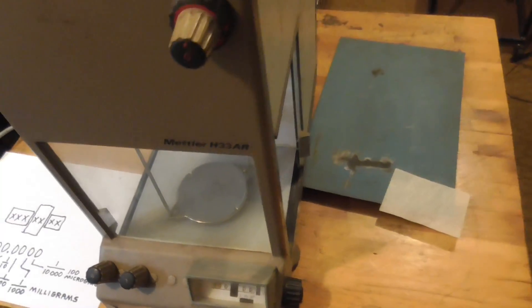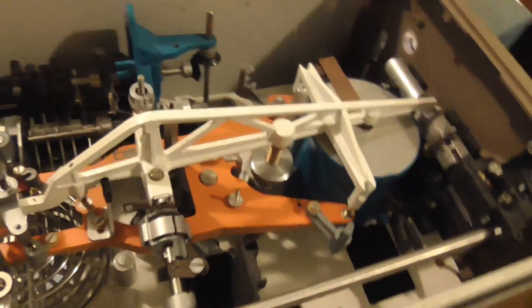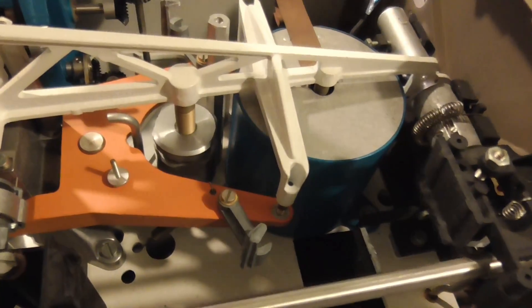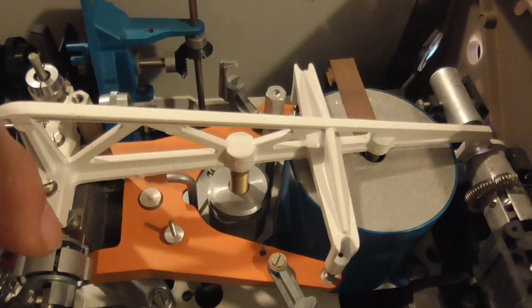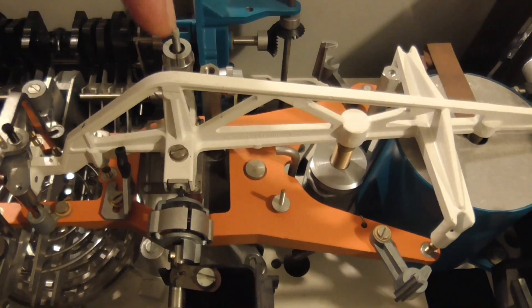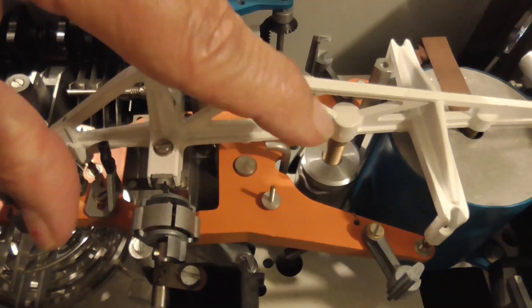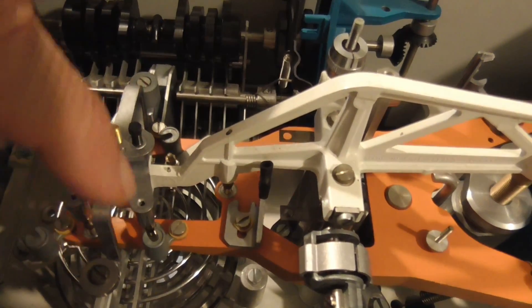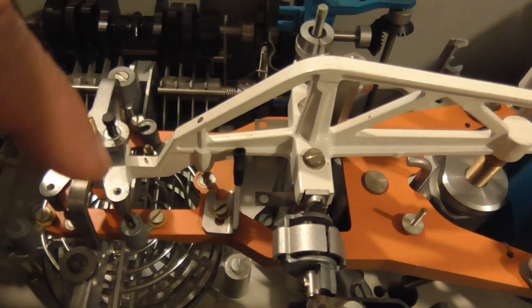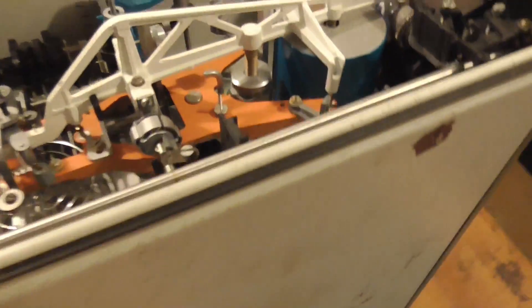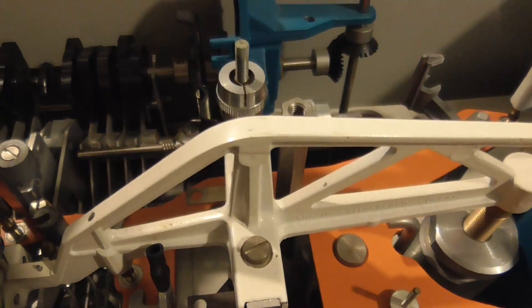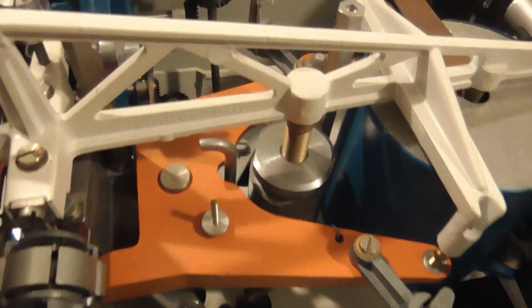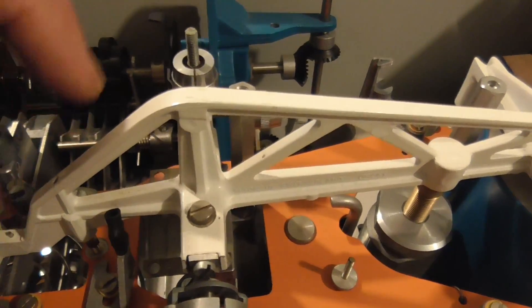The balance mechanism is made up of this beam, and it is pivoted right here. It can sway back and forth. This particular part right here is connected through a rod down to the pan. So when the weight changes on this particular part, then this beam will move up and down.